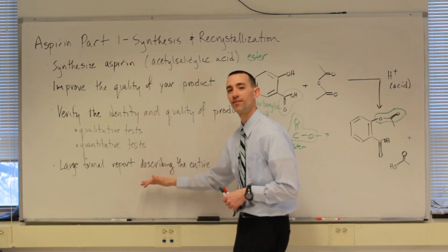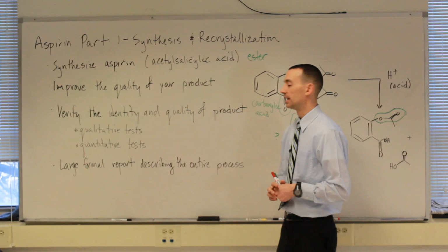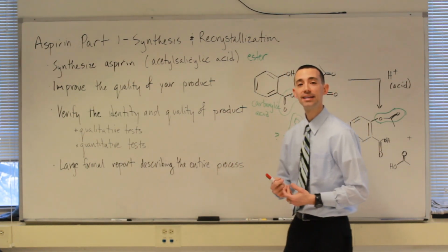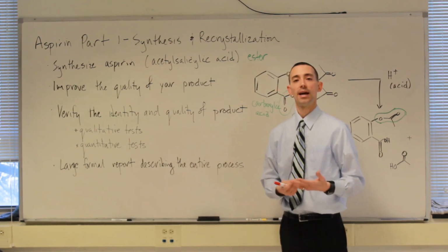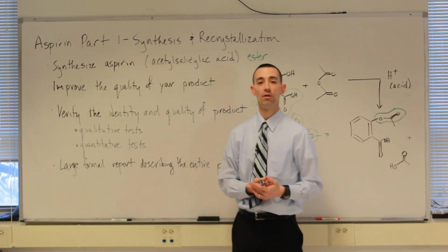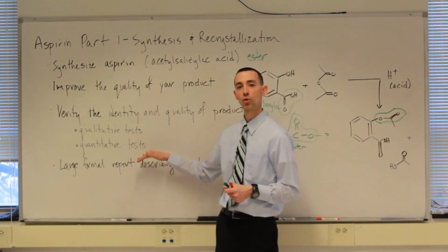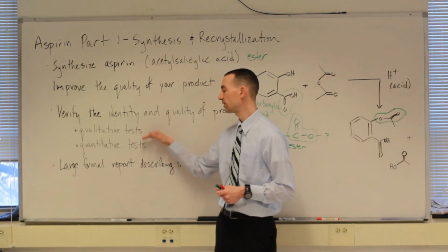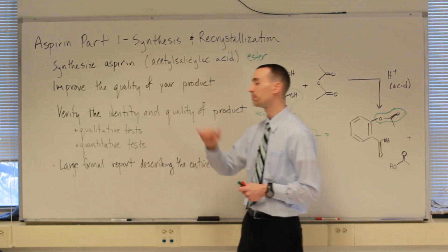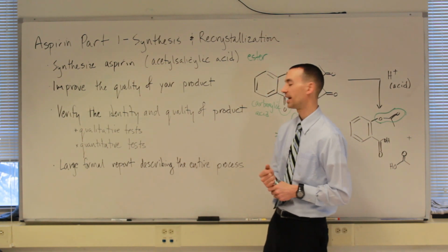So when it's all done, we'll have a large body of work that will allow us to say, did we successfully make aspirin using this reaction? And how successful were we? How good was the quality of our product by comparing it to aspirin that we can buy at the store? So we'll do that. Same store-bought aspirin, we'll run it through the same set of tests to see how it behaves so that we can then compare it to our homemade aspirin or lab-made aspirin as it is.